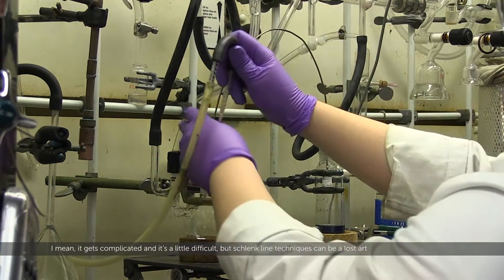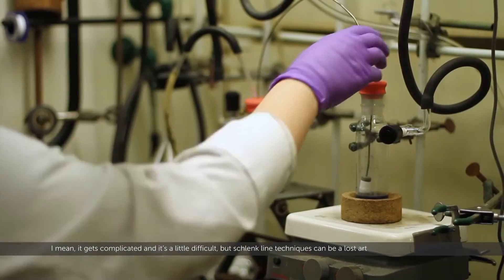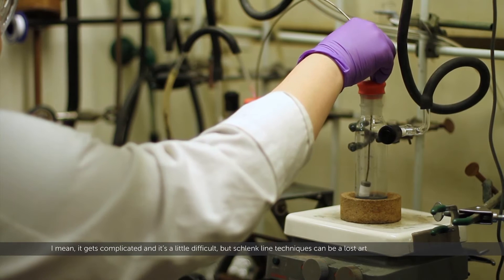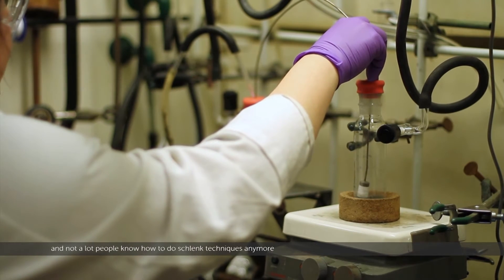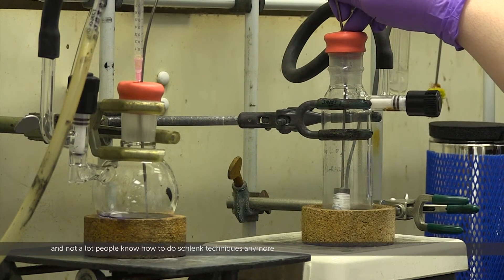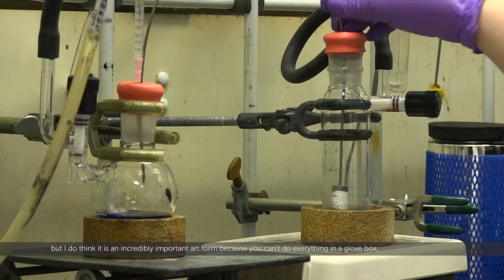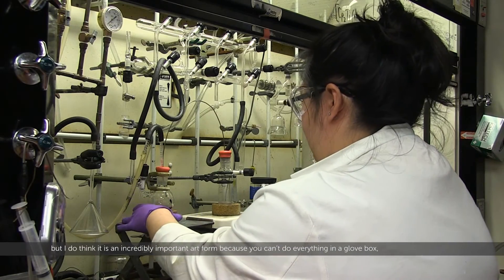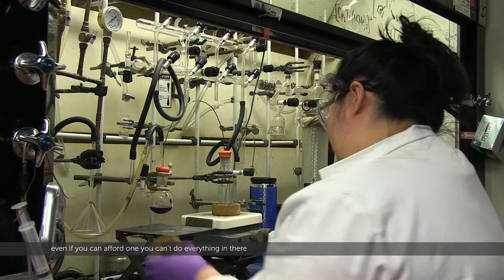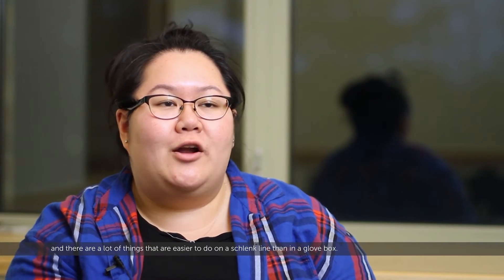It gets complicated and it's a little difficult, but Schlenk line techniques can kind of be a lost art. Not a lot of people know how to do Schlenk techniques anymore, but I think it's an incredibly important art form because you can't do everything in a glove box — even if you can afford one. And there are a lot of things that are easier to do on a Schlenk line than in a glove box.